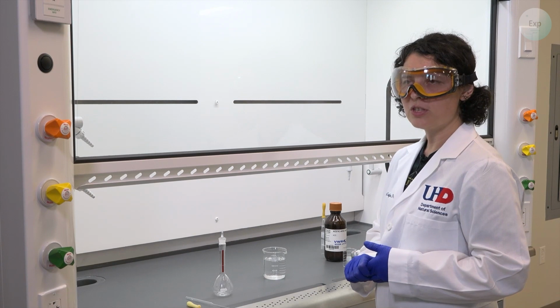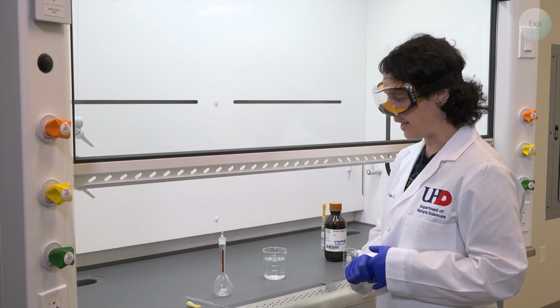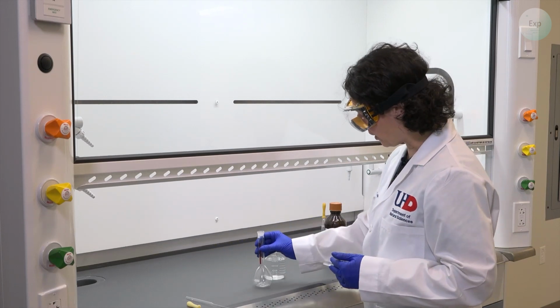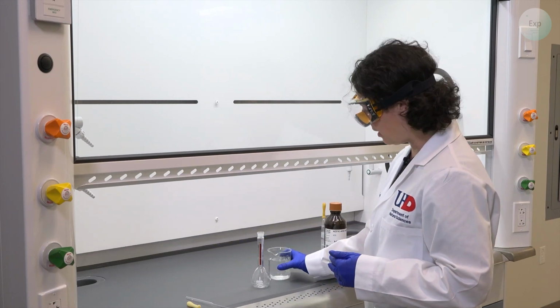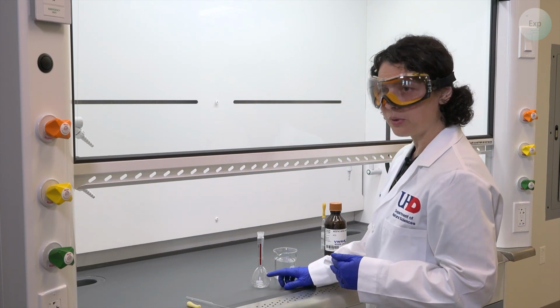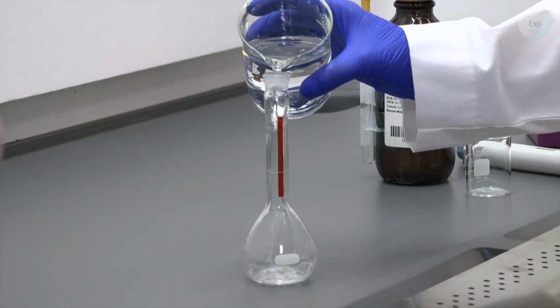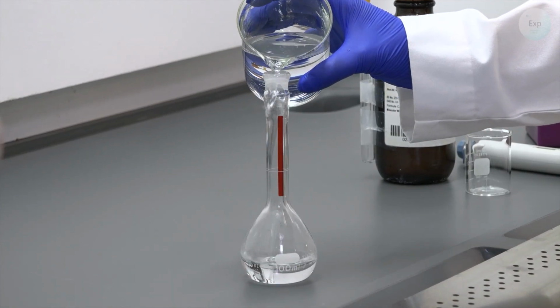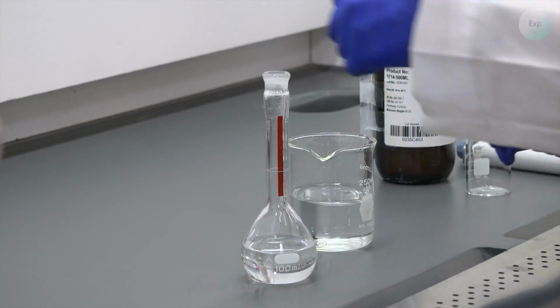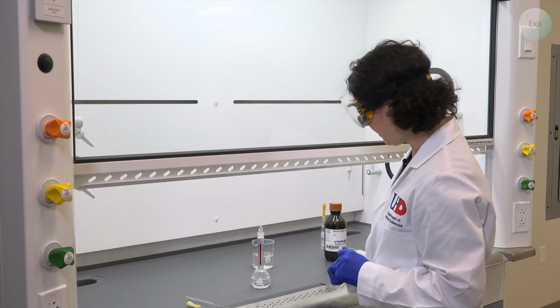For all acid dilutions, the first thing we do is add water to the volumetric flask. So in this case, we're going to remove the cap from the volumetric flask and then pour enough deionized water that it hits about halfway to 3/4 of a way in the volumetric flask. We can set the water to the side temporarily.